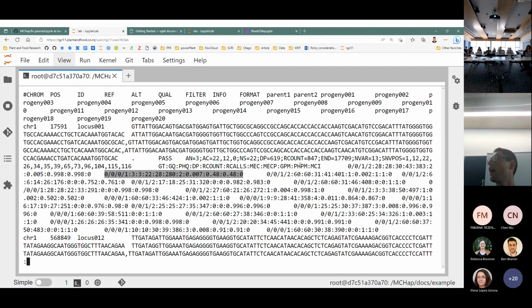I might need a bit of a better description of that, Elena? It's not based purely on the counts or observations. It's got a probabilistic function in there, so it's not that it requires this many observations of that read to call the allele. It takes the numbers of observations of an allele, and it also takes into account the inbreeding coefficient, the ploidy, and then it produces probabilities. So these probabilities for the genotype call are output in the VCF file.